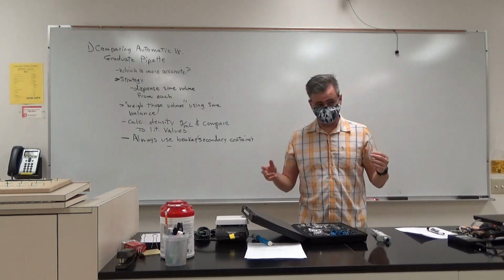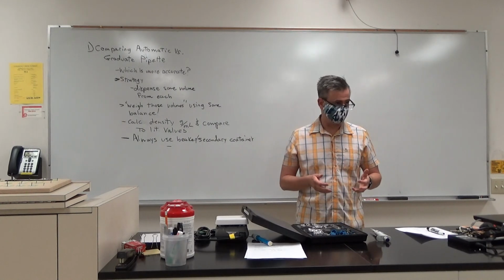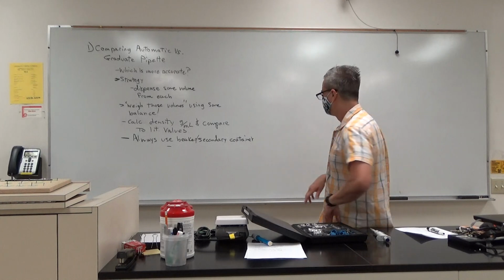As long as you don't, the only downside to not using them is evaporation of the liquid that you just put in there. And that's pretty slow, unless you set it there and go eat a sandwich and then come back. You're going to be okay.